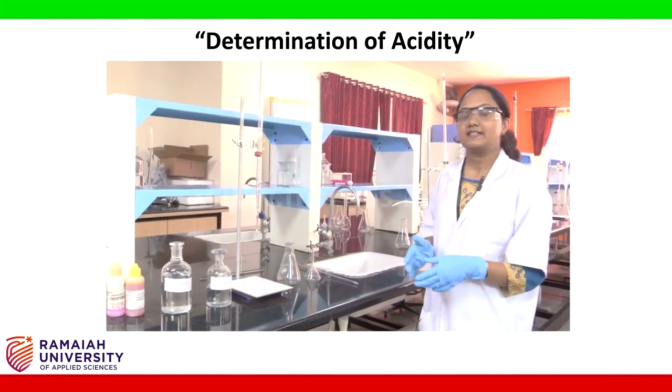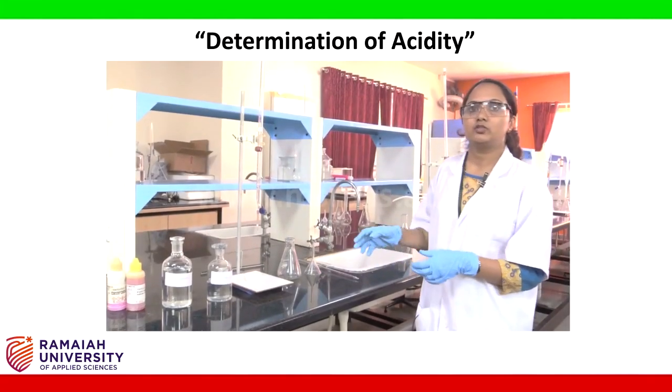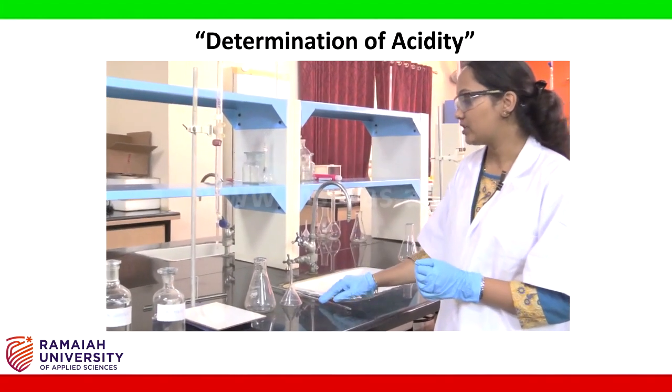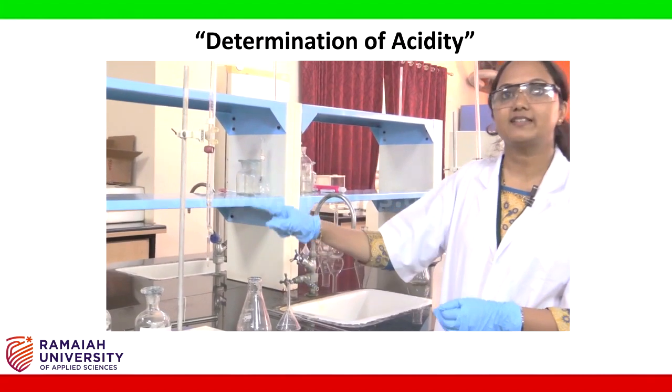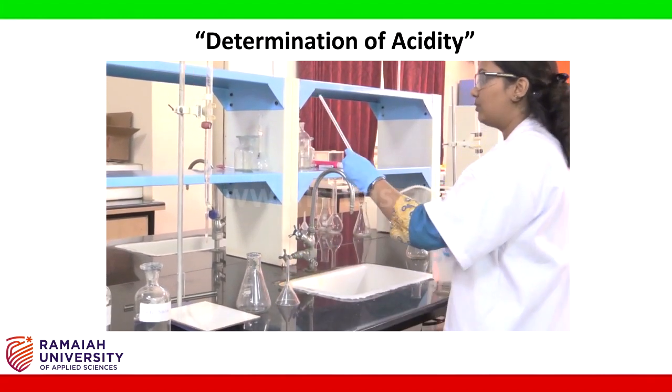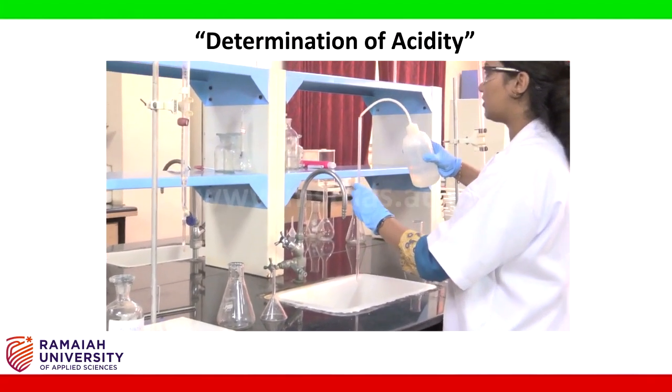Before starting with the experiment, we need to rinse all the glasswares, that is the pipette, the funnel, conical flask and burette. So we will rinse the pipette with the distilled water.